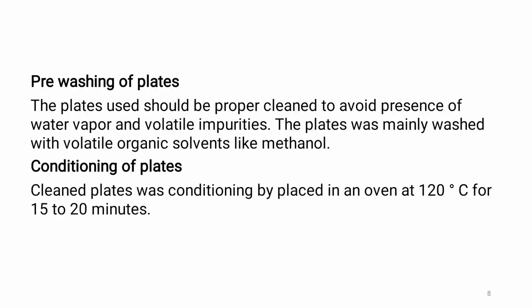The next component is the pre-washing of plates. The plates should be properly cleaned to avoid the presence of water vapor and volatile impurities. The plates are mainly washed with volatile organic solvents like methanol. The next point is conditioning of plates. Clean plates are conditioned by placing them in an oven at 120 degrees Celsius for 15 to 20 minutes.